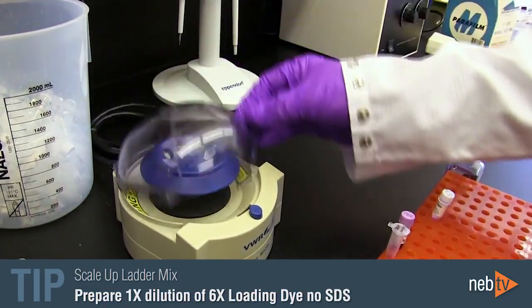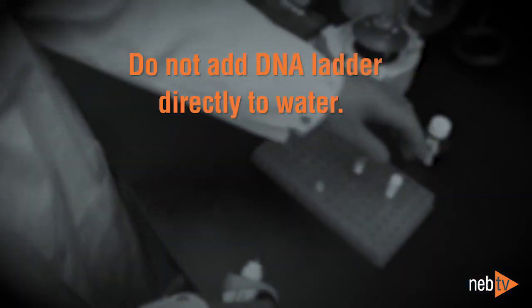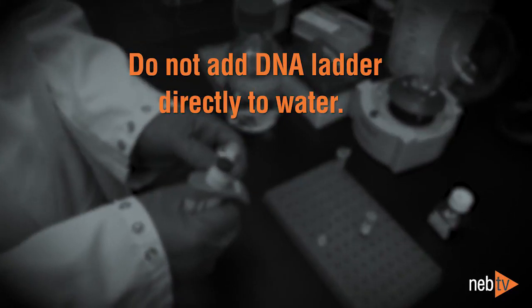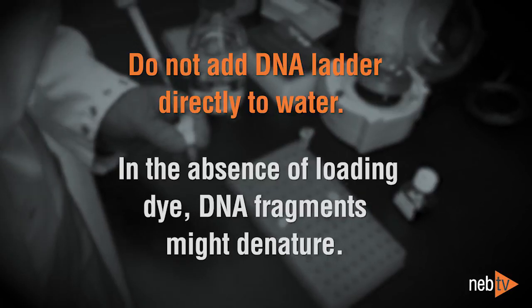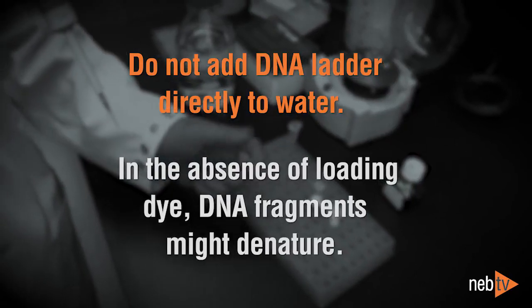Flick the tube with your finger and spin it briefly. The DNA ladder is then ready to load. You want to avoid diluting the DNA ladder in water directly without the loading dye present, because when the ladder is in the presence of water without loading dye, some of the DNA fragments can denature.